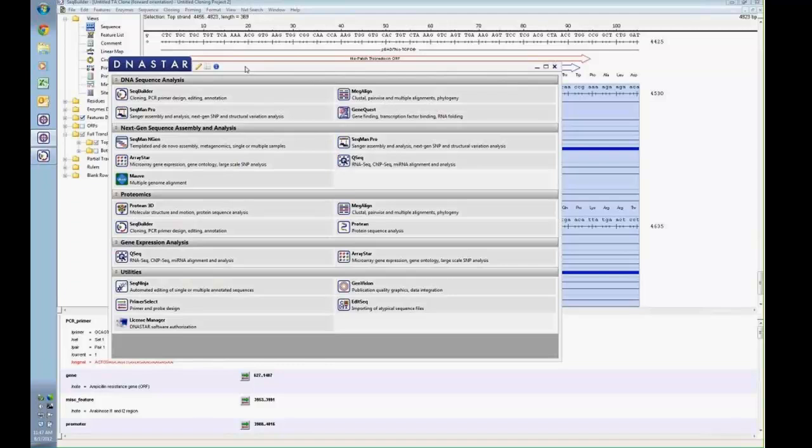If I double-click on the sample, briefly, there was a question about bringing data into SeqBuilder, specifically from a big dye Sanger reaction. When you bring it into SeqBuilder, it's simply going to bring in the nucleotide string. If you wanted to view these electropherograms, that's why we've developed SeqMan Pro. That gives you the option to view those electropherograms. It also looks at the quality of the individual peaks and assigns quality scores built into the software.